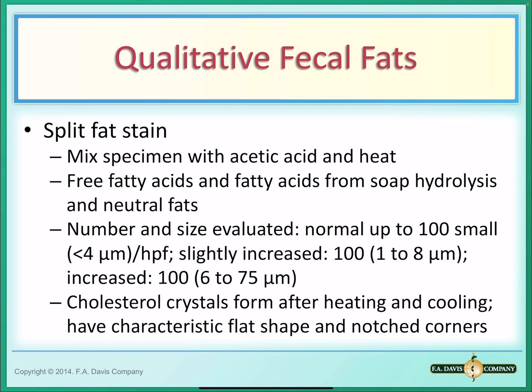You may also see some cholesterol crystals that form after the heating and cooling while you do the procedure. These will have a characteristic flat shape and notched corners. Again, these are cholesterol crystals that you may come across while you do your split fat stain procedure.